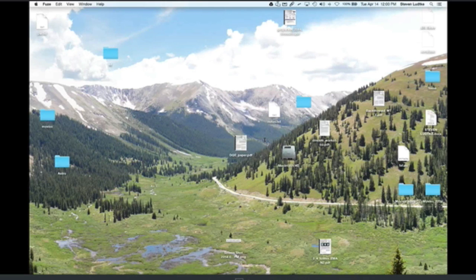Great, yeah. And if anyone has any questions, feel free to put them in the chat. I'll pass them on. Thank you very much, Steve. EMAN2 is very impressive. Thank you particularly for the command tab. I would like to urge you to talk to all other software developers and urge them to add the command tab to all of it. Yeah, that was added for a reason.